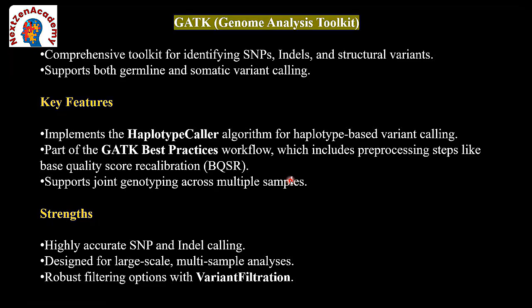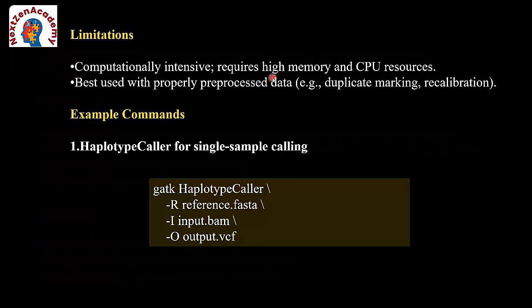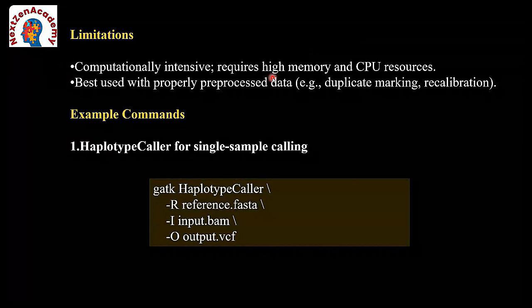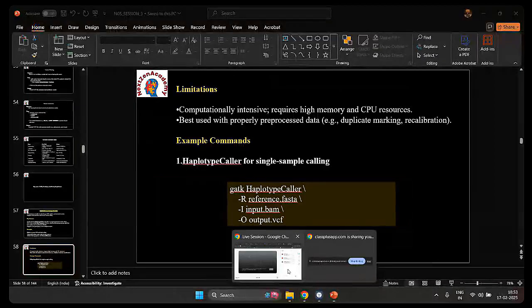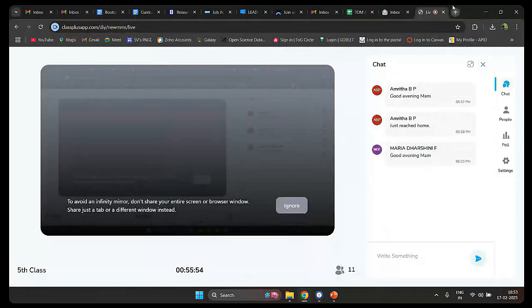Then in other conditions, it is having highly accurate SNPs and Indels, and it is designed for larger scale datasets. So let me take you to the website called GATK.